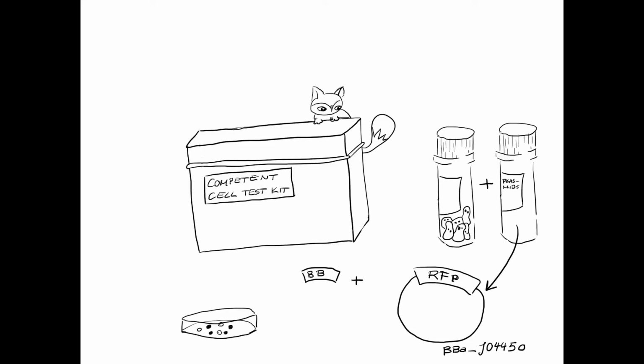These ready-to-use plasmid backbones, once again the standard pSB1C3, pSB1A3, pSB1K3, come with a very special biobrick in them, the red fluorescent protein, RFP or BBa_J04450. We highly recommend using these plasmid backbones in your project because you can use them as a selection marker for bacteria that took plasmids which were not successfully digested or that unfortunately religated with the RFP and not the biobrick from your experiment.